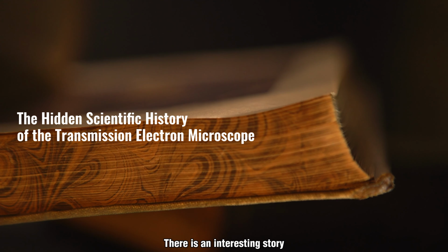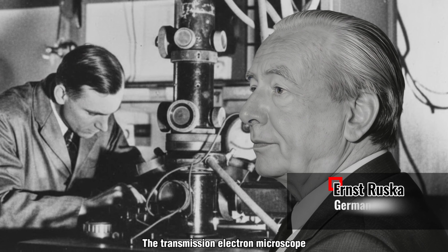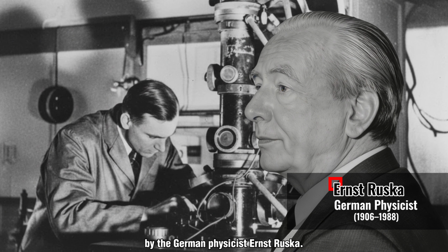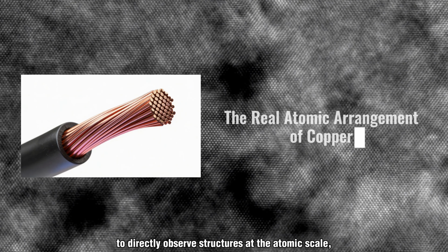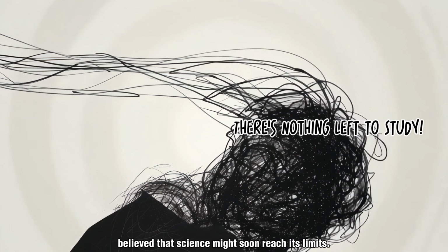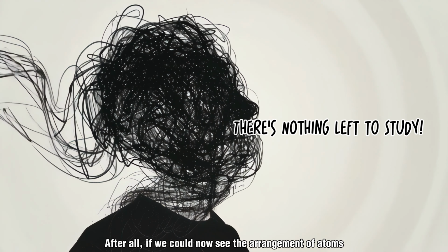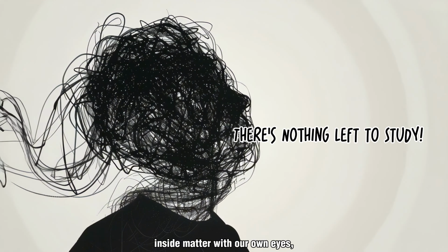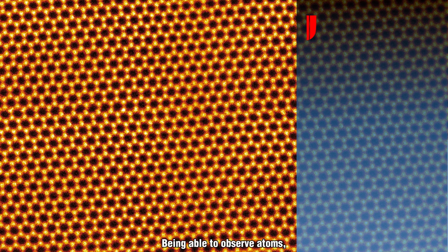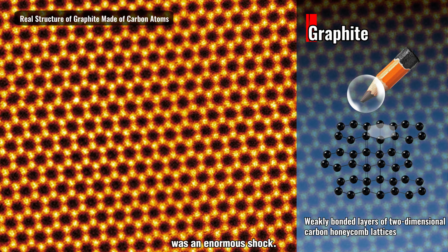There is an interesting story from the history of science connected to this microscope. The transmission electron microscope was first developed in the early 1930s by the German physicist Ernst Ruska. When this technology made it possible to directly observe structures at the atomic scale, some physicists at the time believed that science might soon reach its limits. After all, if we could now see the arrangement of atoms inside matter with our own eyes, it seemed as though there might not be much left to discover. Being able to observe atoms, something that had existed only in imagination until then, was an enormous shock.